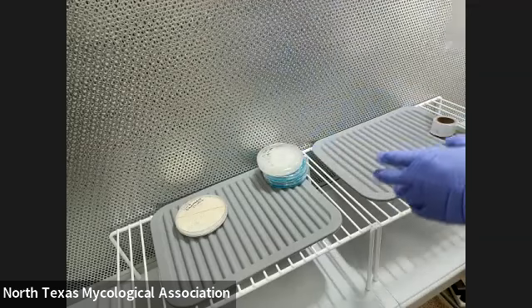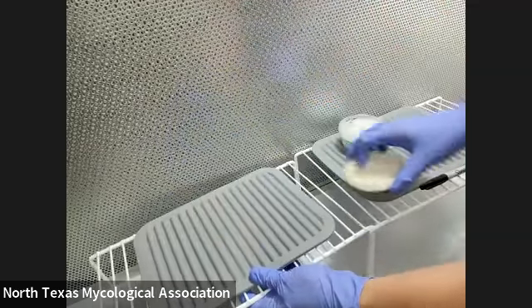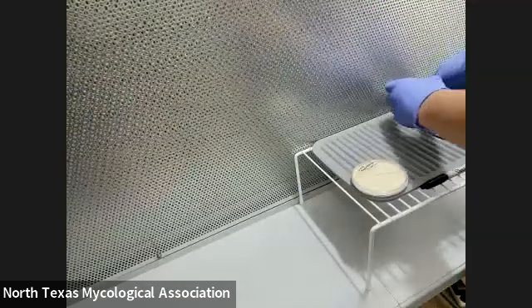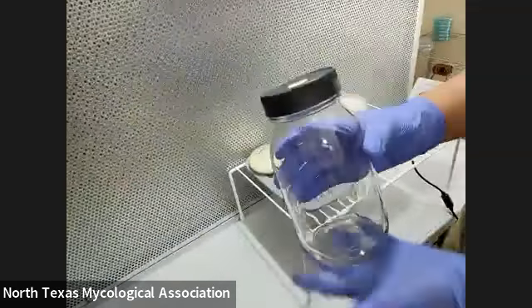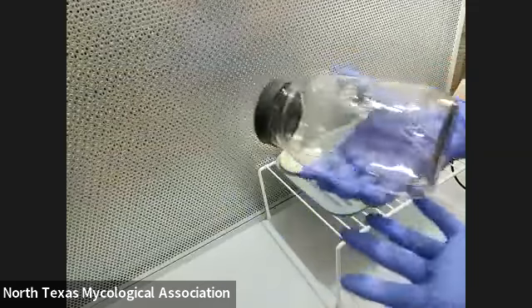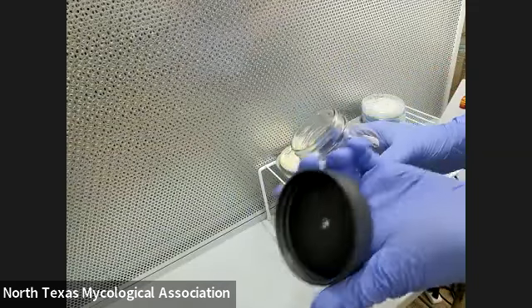I'm going to show you how to do a grain transfer. This would be filled with sterilized grain like I showed you, but since I don't have that made, I'm just going to use an empty bottle. This is just a mason jar with a plastic lid that I bought at Walmart.